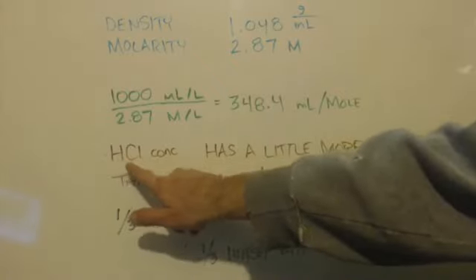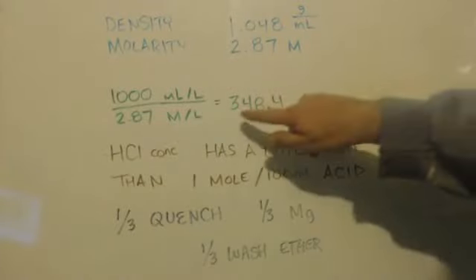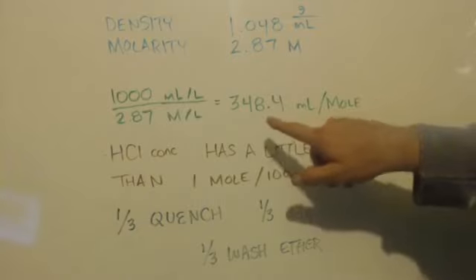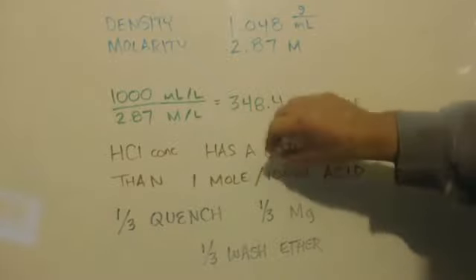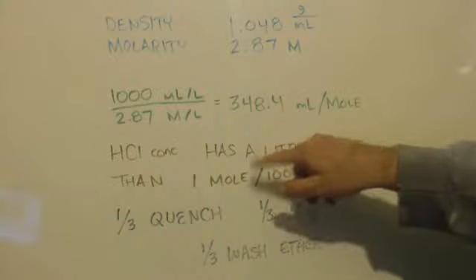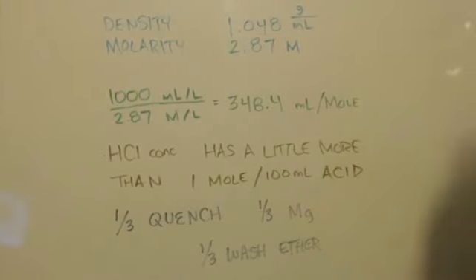So we also know that concentrated hydrochloric acid you get at the store, like Lowe's, has a little more than 1 mole in every 100 milliliters of acid. So what am I going to do to make my 10% hydrochloric acid? I'm going to get 100 milliliters of concentrated acid that I got at Lowe's. We know there's a mole in it, right? This is what you need for a 10% solution: you need to have this much liquid with 1 mole of HCl. So I'm going to take the 100 milliliters and pour it in half of this, because this is 348 afterwards. When these mix, you can't mix volumes like 2 plus 2. It doesn't work out that way. So you have to add the acid to a little bit of water, and then add more in to make it go all the way up to 348 milliliters. Then you will have your 10% solution.